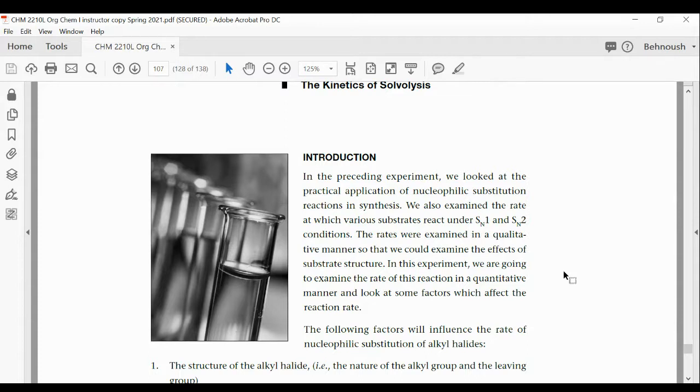That's the standard. So if we change the polarity, like to 80% based on the procedure, in a different trial, you want to find out how much faster the reaction will take place in a more polar solution.